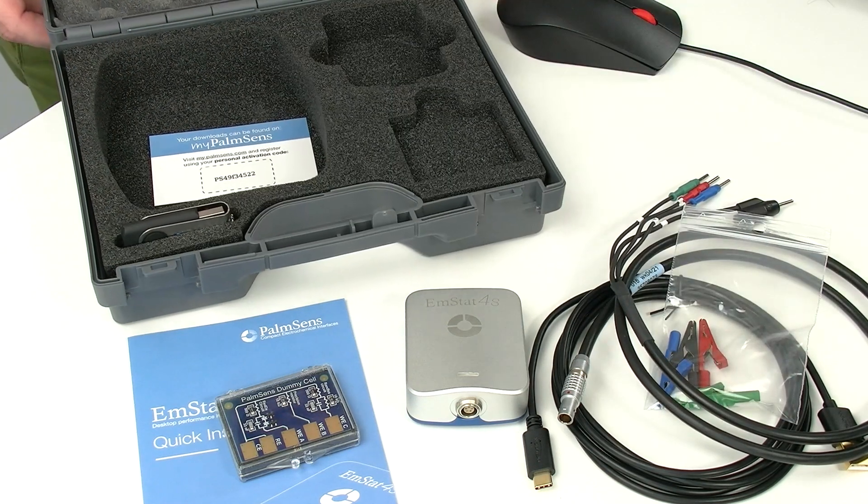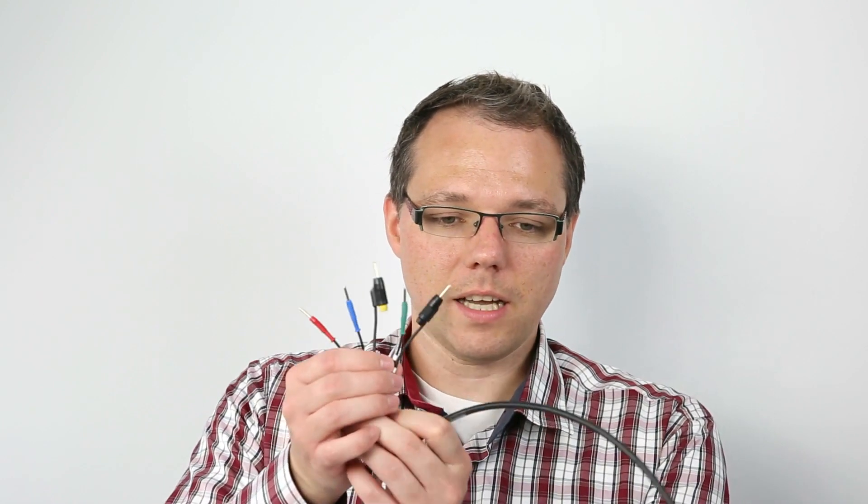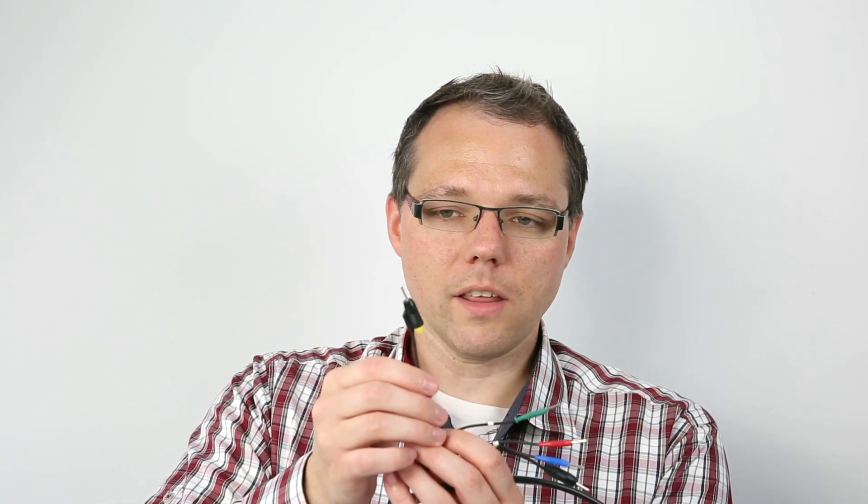If you have the high range version — the one with the black bottom — then you will receive a different cable. This cable has an additional plug which is yellow and stackable. This is the working sense, which is required for the high range version of the EmStat 4.